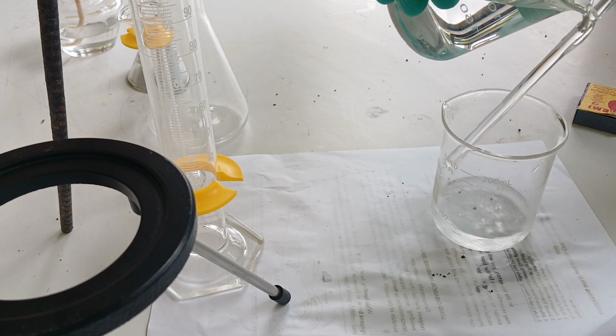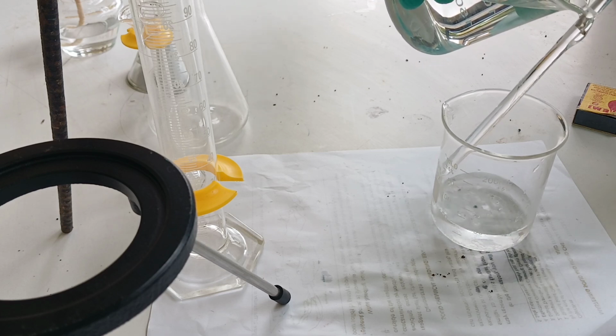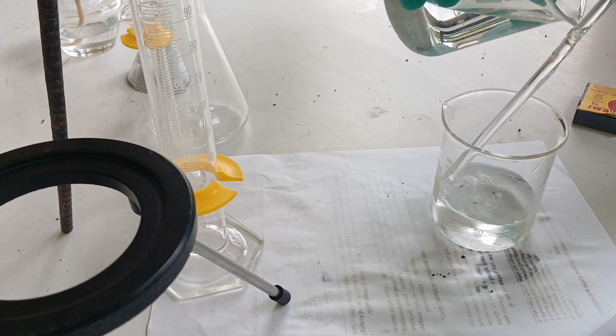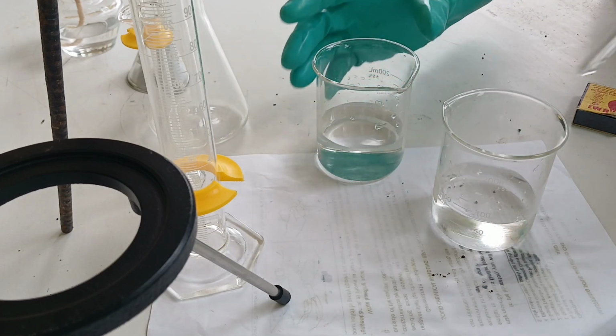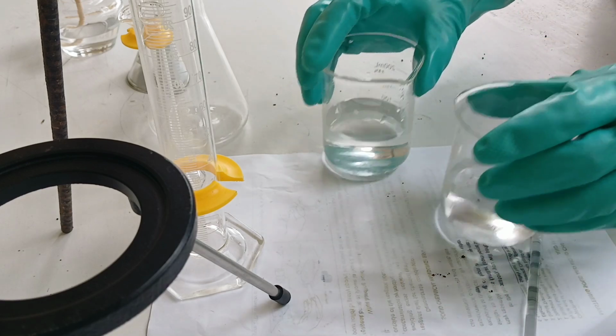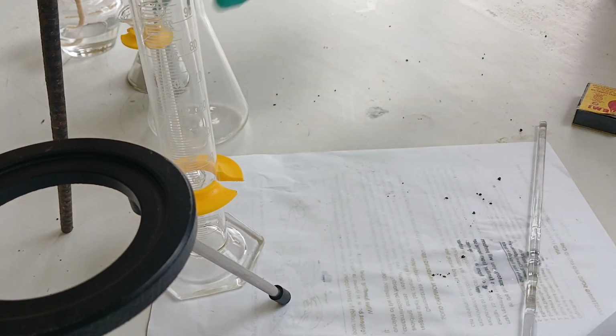Avoid splashing, no spillage. In my case, something spilled out, a minute quantity of liquid, but there's supposed to be no such spillage. Yes, that's it. That's how you're going to transfer.